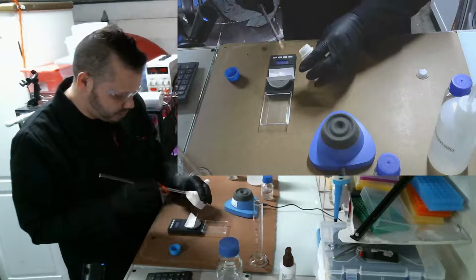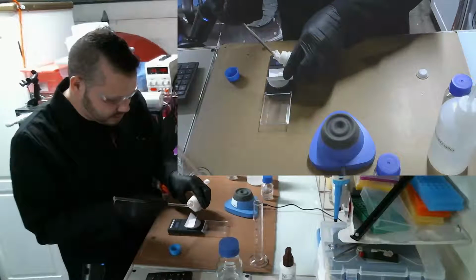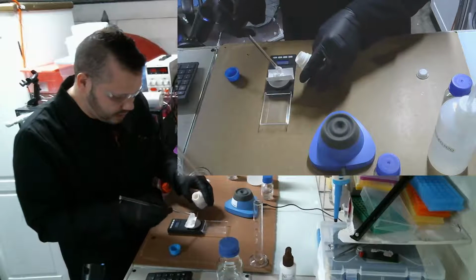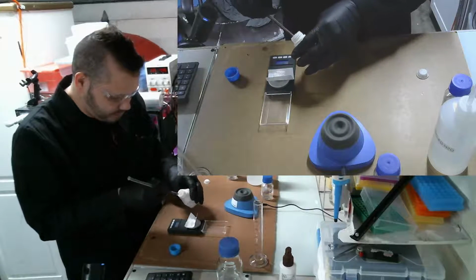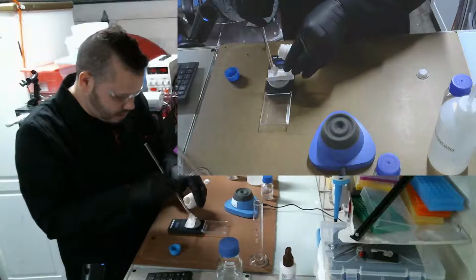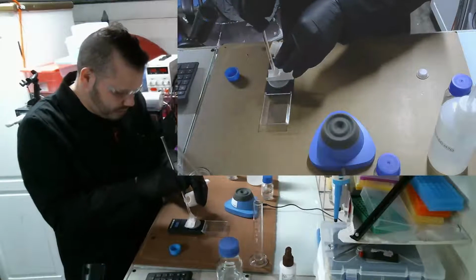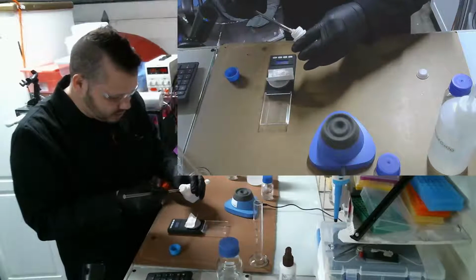What I'm going to do is use both indole acetic acid and Naphthaleneacetic acid, and then I'm going to have a control group. The idea is I'm going to subject them to the hormone treatment for 3 months. And I'm going to see if after 3 months there are any issues that don't go away once the treatment is over.